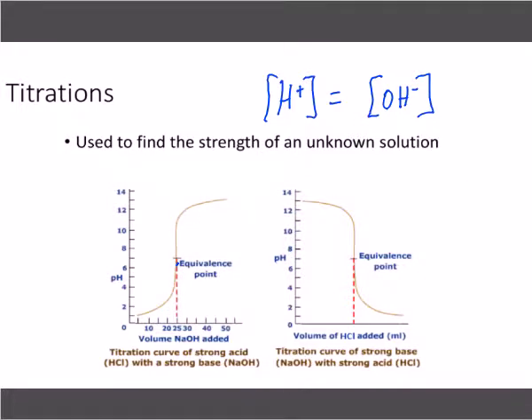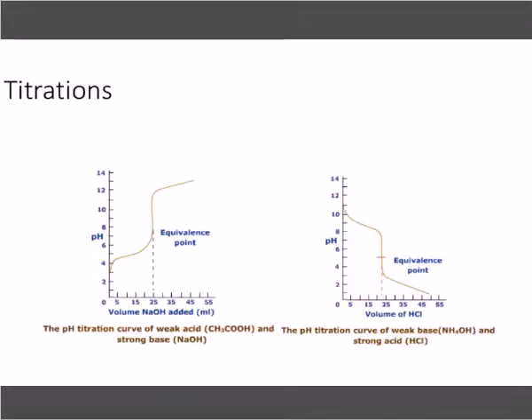That's why if you weren't sure if it was maybe slightly pink, I said, hey, record the volume down. If you had one more drop, you know you've jumped up to the base part of it because you've gone just a little bit past this equilibrium here, where they are equal. So that's what we're trying to get to. So when we go to do our math, we're doing it based on the equivalence point in our reaction. And that's where knowing the ratio between them is important.